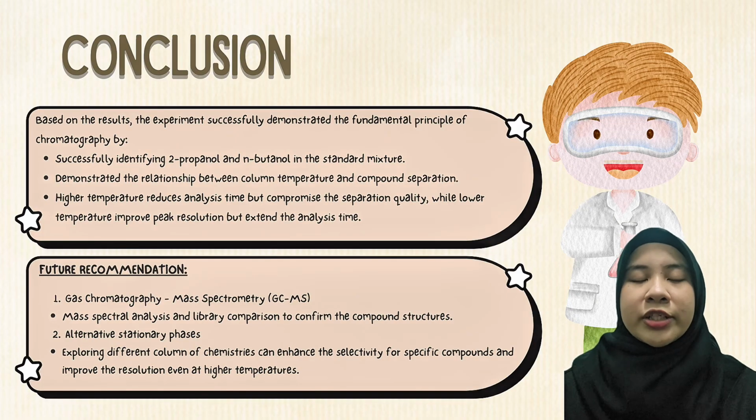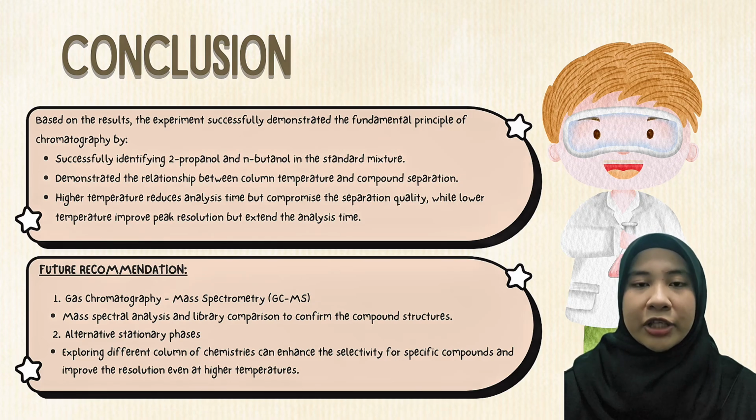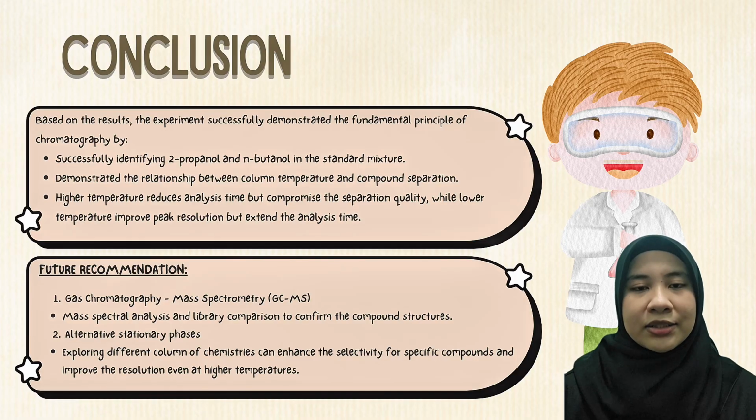In conclusion, our experiment successfully demonstrated the fundamental principle of chromatography. We were able to achieve a clear separation and identification of our two target compounds, which are 2-propanol and N-butanol. This success confirms that our initial parameters were well suited for basic qualitative analysis.